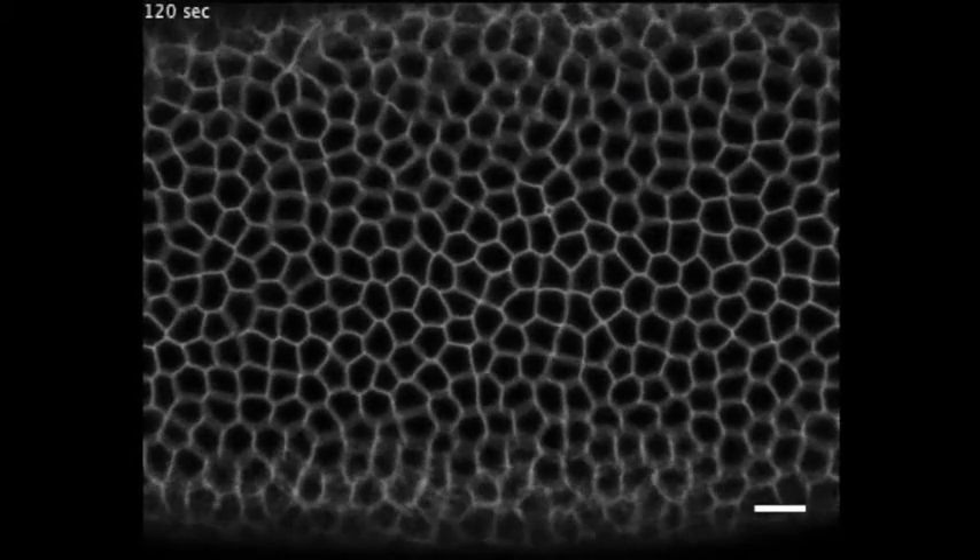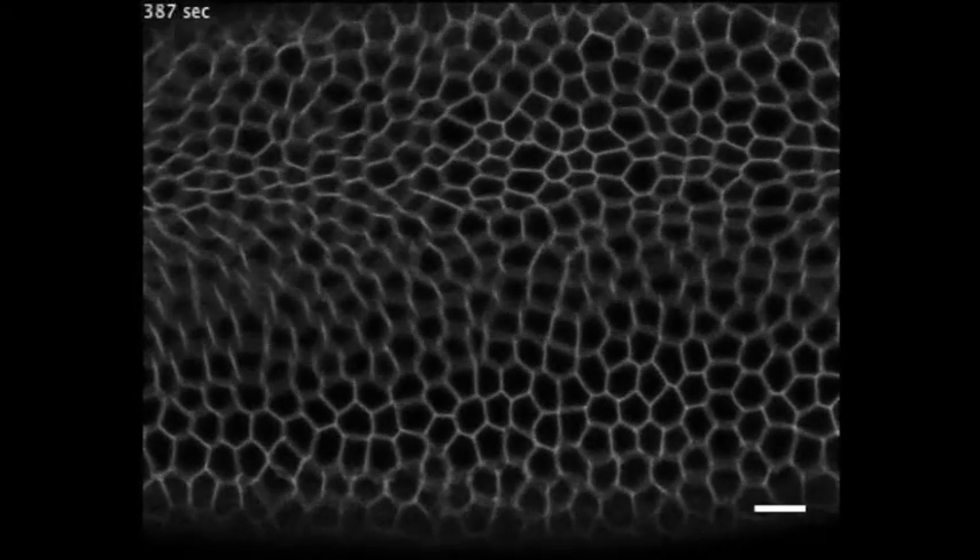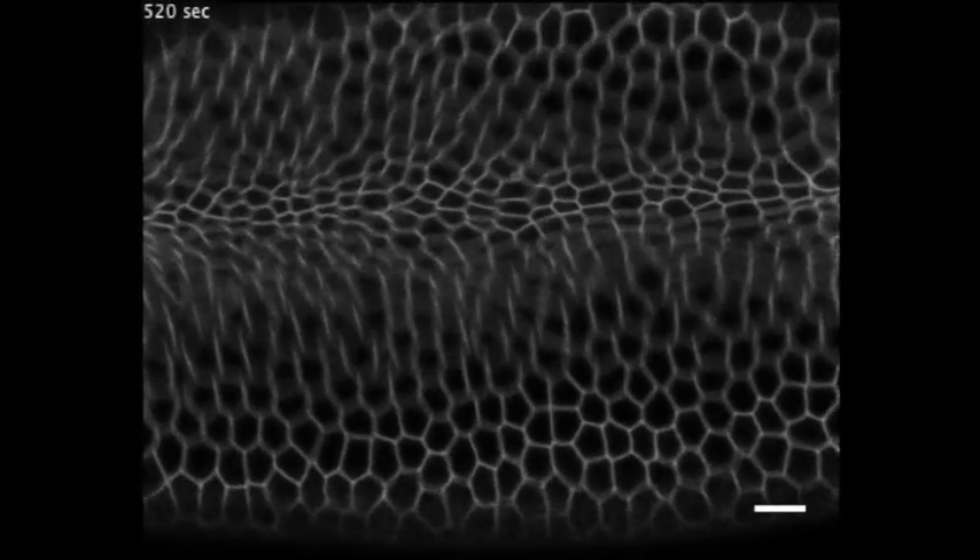At around four hours of development, cells on the underside of the fruit fly embryo start contracting and move inwards, folding into a tube.